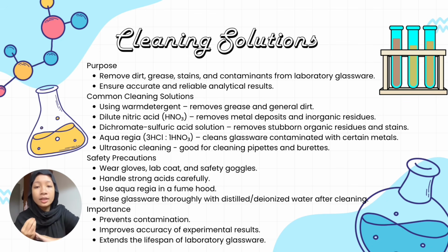Then, when handling these cleaning solutions, safety precautions must always be followed. Laboratory personnel should wear gloves, safety goggles, and a lab coat. It is because strong acid must be handled carefully, and aqua regia should only be used in a fume hood because it releases hazardous fumes. After cleaning, all glassware should be thoroughly rinsed with distilled or deionized water to remove any remaining chemicals.